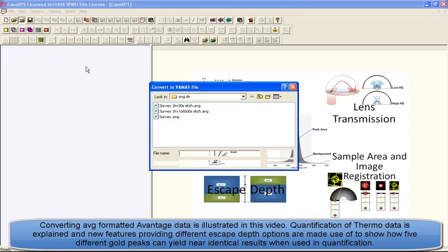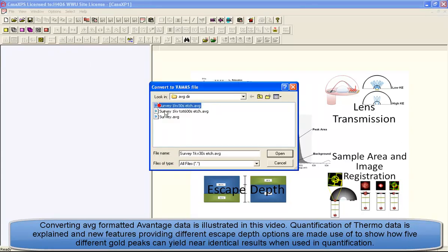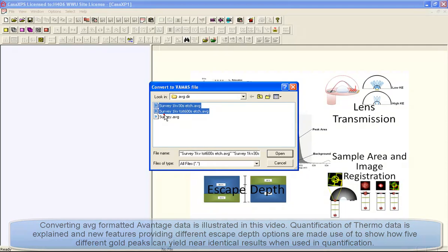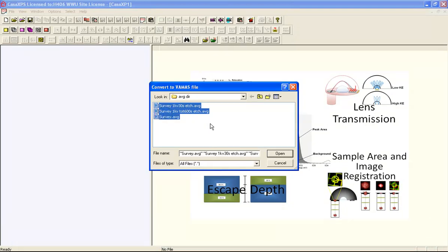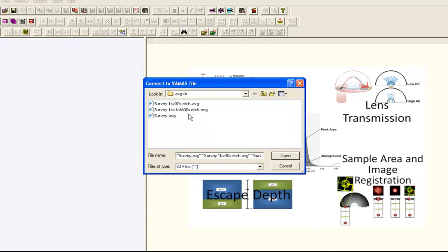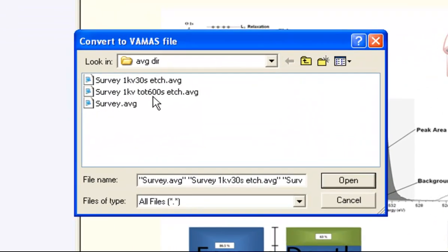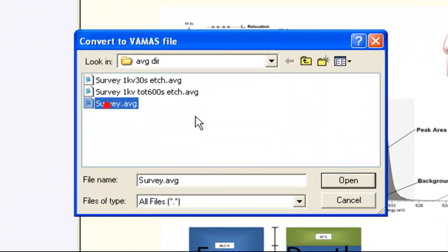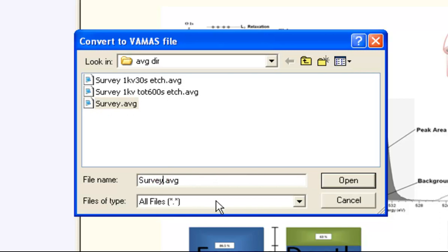These data are from a set of measurements from GOLD spectra and they are all AVG files. These are ASCII files that have been exported from Avantage. To convert these, you collect them in a directory.